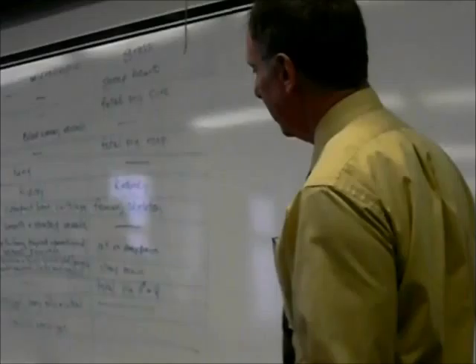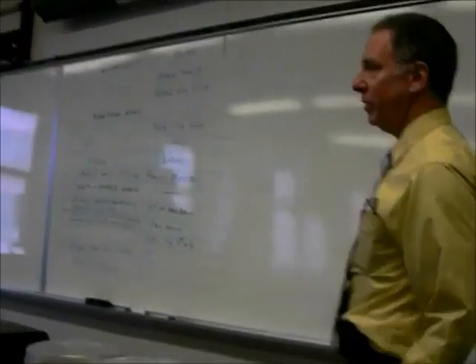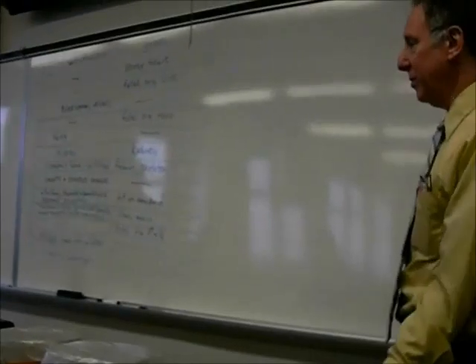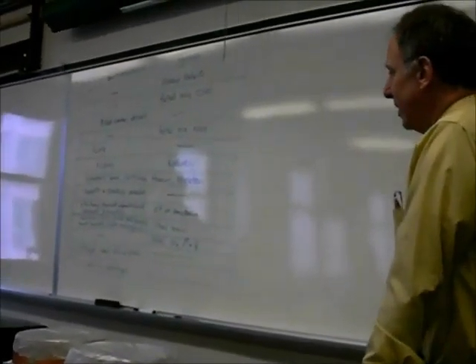Chapter 17, just smooth and striated muscle. You remember that cardiac muscle will not be on it because it really doesn't show up. Its distinguishing features are not distinguished on these slides.